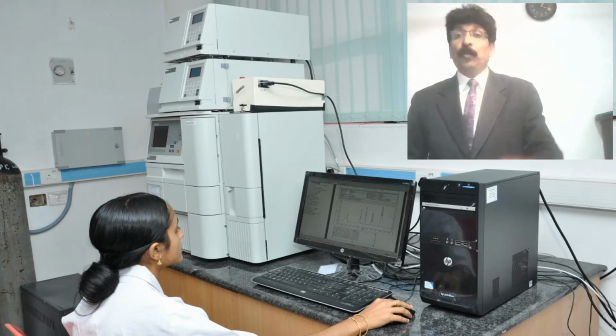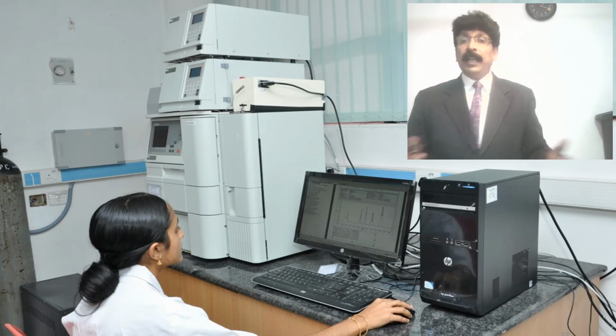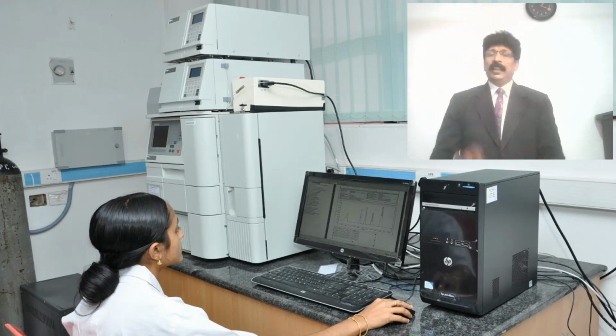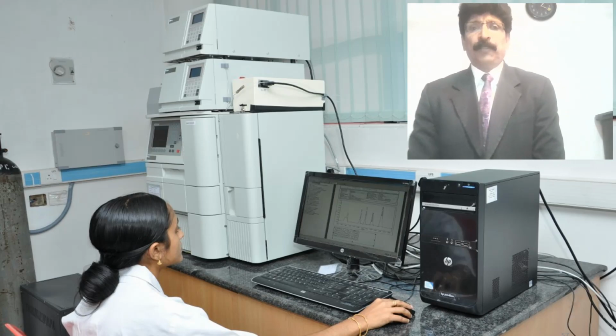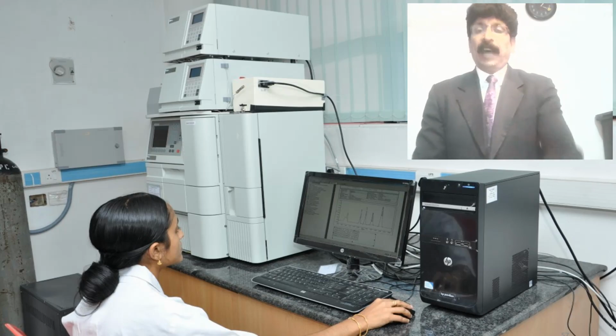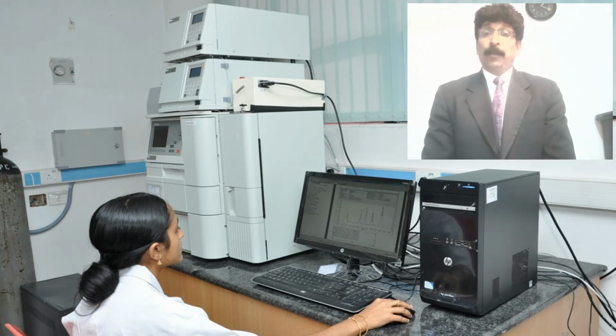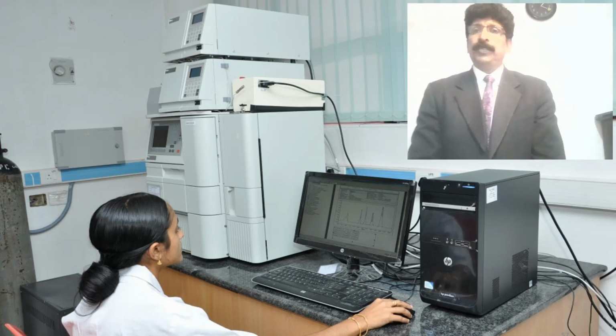You know both the words. Isocratic means single solvent system, gradient means just increasing the solvent polarity or decreasing the solvent polarity by means of ratio of mixing of different solvents. A system for mobile phase can also be used here. So you can see the graph which is shown in the computer, which she was observing about the separation of the compound, and quantitative and qualitative analysis can also be identified.